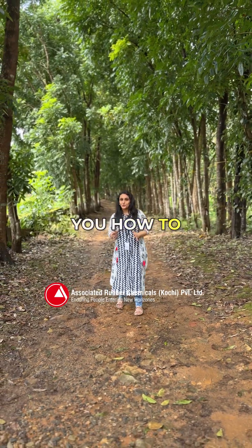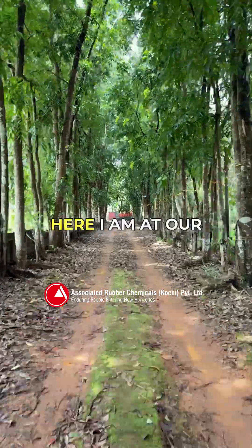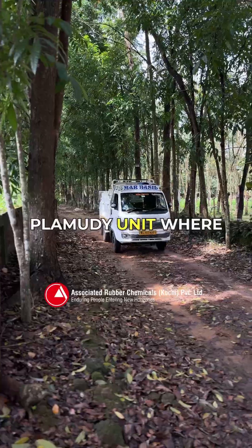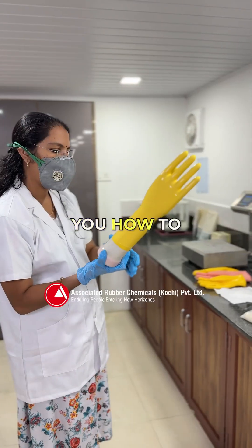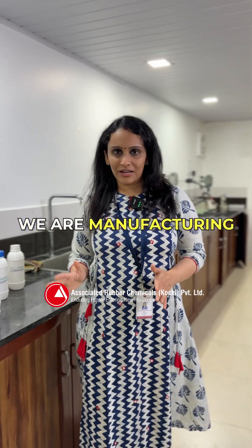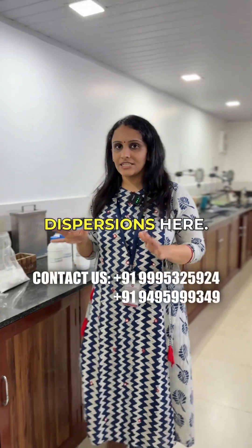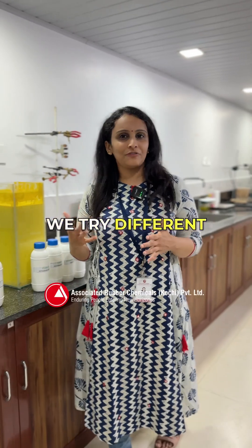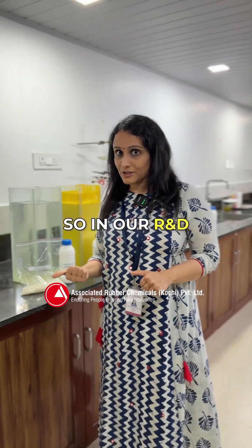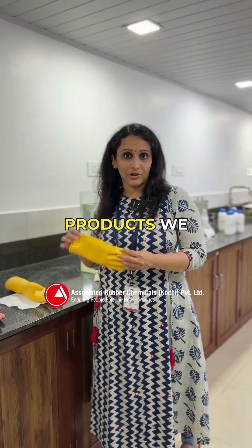Today we will show you how to manufacture gloves. Here I am at our Plamudi unit where we have an R&D facility. We are manufacturing rubber chemical dispersions here, and to test our rubber chemical dispersions we try different methods. In our R&D facility we test the end products we make here.